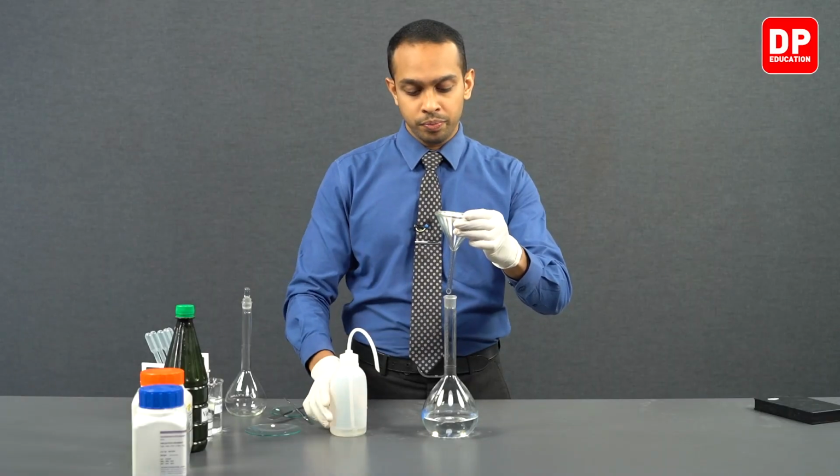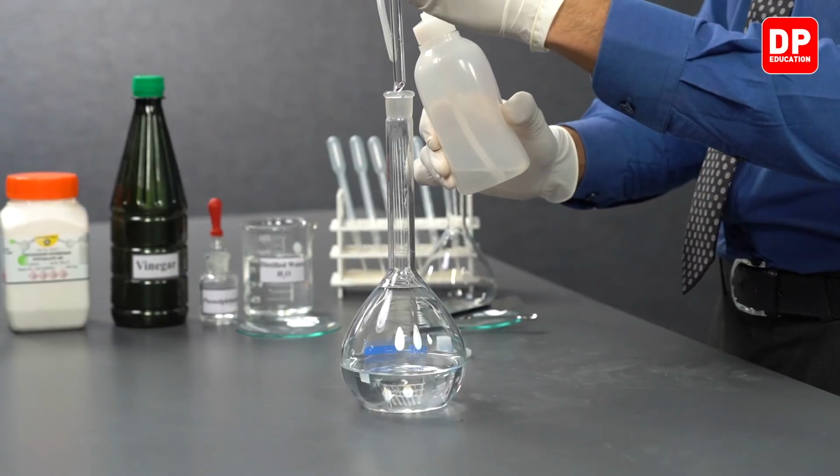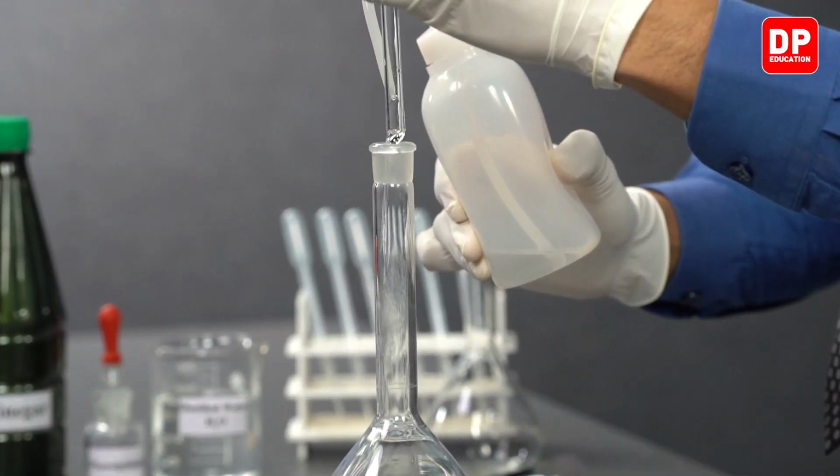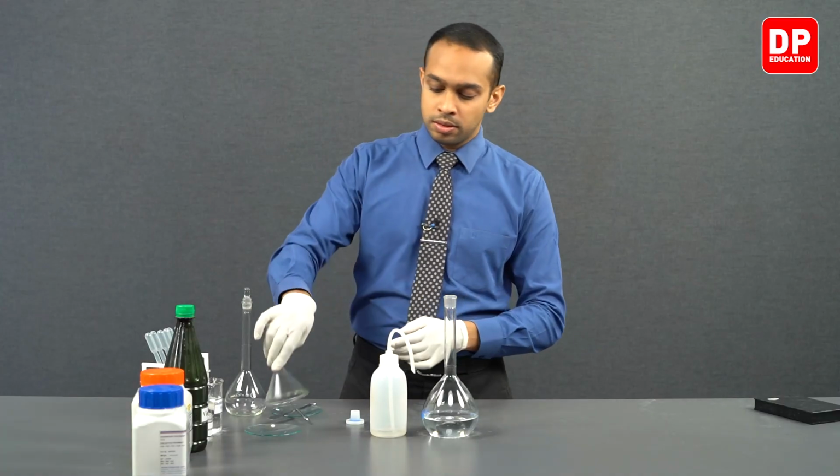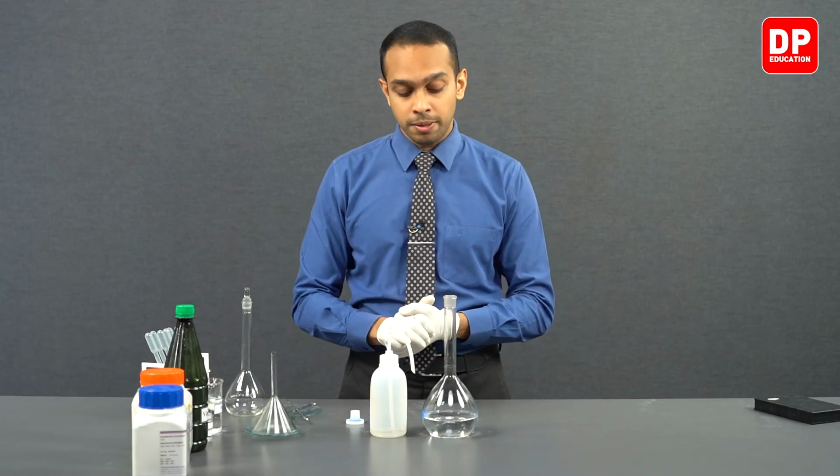After doing so, you can even wash the tip of the funnel with a little bit of water and keep the funnel aside.